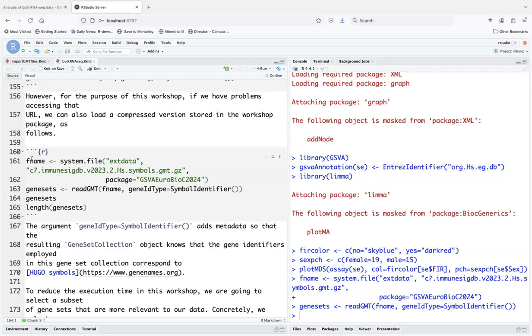We're not yet there. He's getting there. But if you can wrap up in a minute the next step of running GSVA, because then I want to have a couple of minutes to talk about single cell.